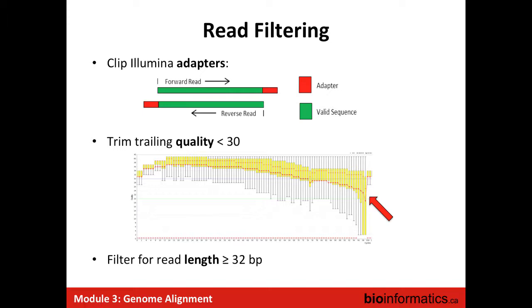we remove this sequence. After that, we take all the molecules, starting from the end of the read, because we know that due to phasing issues of the cluster, at the beginning of the molecule the quality will be really good, and then it will decrease, because with time some molecules will be in advance or late relative to the whole group, and we'll start to see some discrepancy in the sequence we are reading. So we start with the end of the molecules.